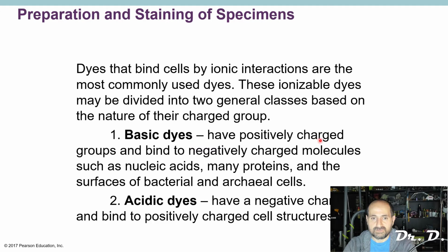Basic dyes have positively charged groups and bind to negatively charged molecules such as DNA, RNA, a lot of proteins, and the surface of bacterial and archaeal cells. So look at this. Basic dyes are very useful in the microbiology lab because basic dyes are positively charged, and the bacteria and archaea that we study are negatively charged, and a lot of the molecules inside are negatively charged.